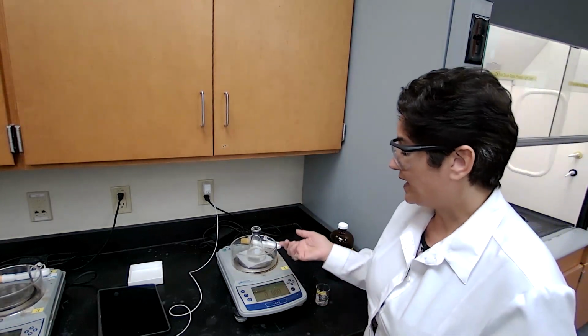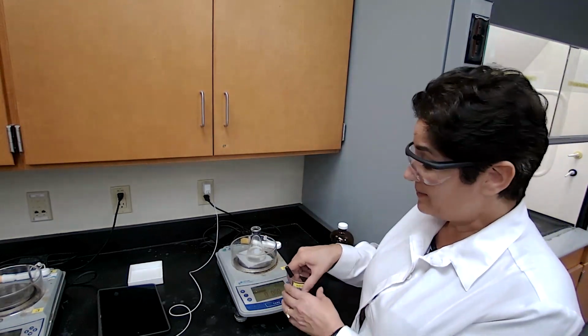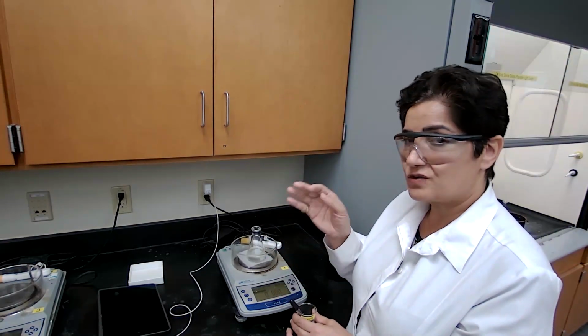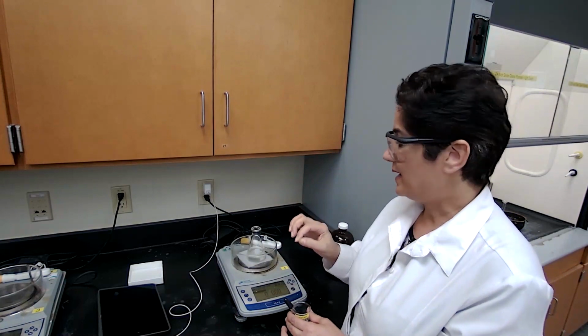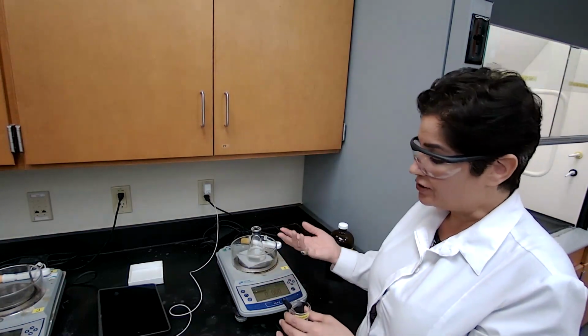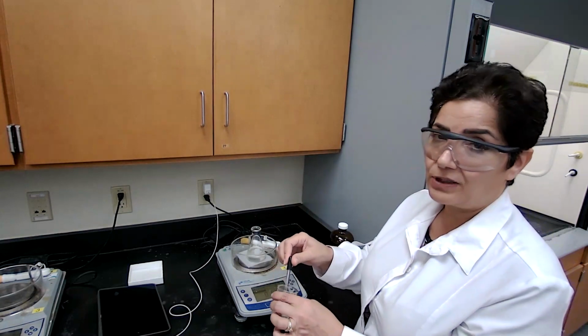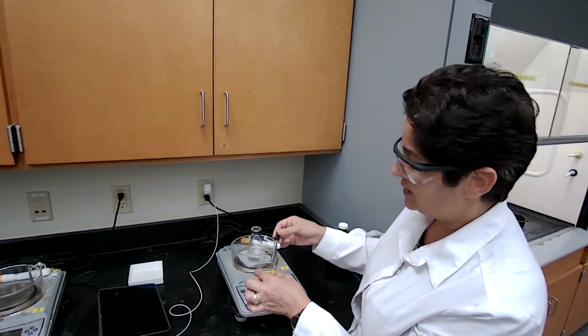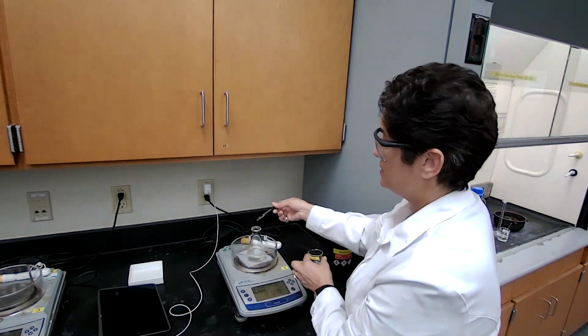If the drop that I'm adding passes that number, as long as it's very close to that number, and as long as I have recorded the exact mass, I should be fine for my calculation later, the calculation for the percent yield of this experiment.